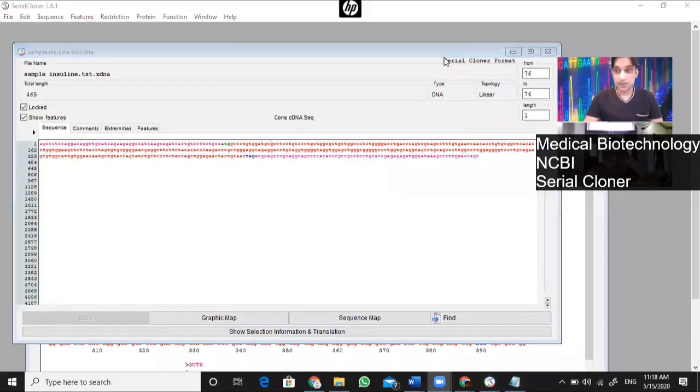Replace it, sir. Who is speaking? Usama. What should we do? Usman, what should we do? Eamon, Anisha. Farhan, look how much fun this is, you can do whatever you like with it. Tell me, we are going to act like gods. Yes, what should we do? Replace it. Replace it.